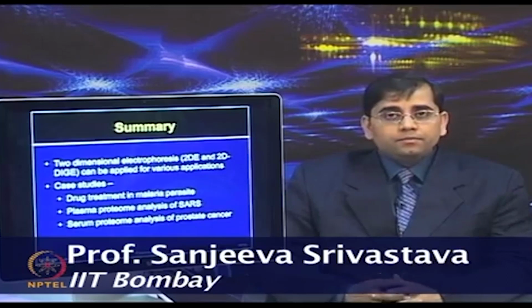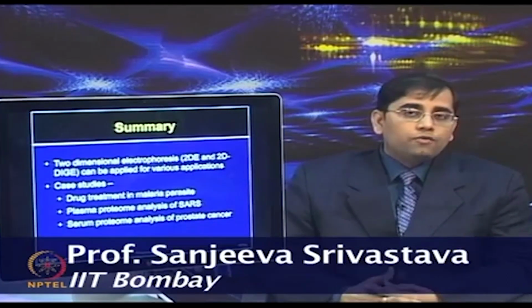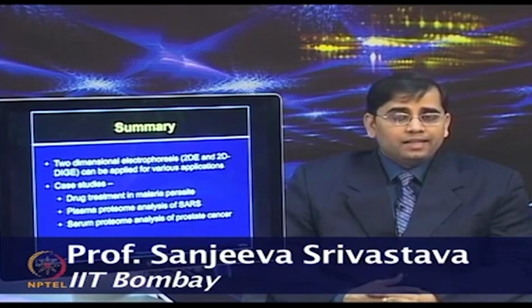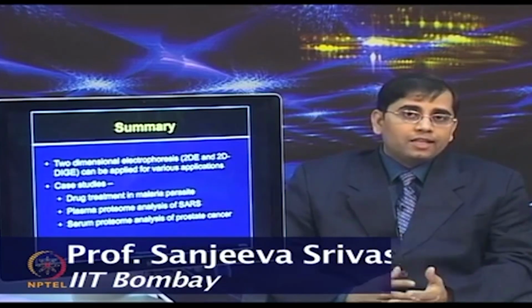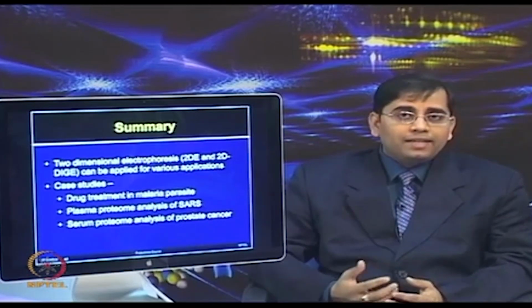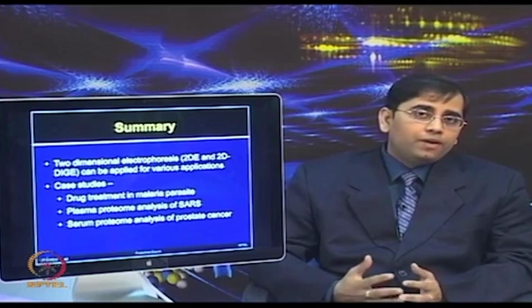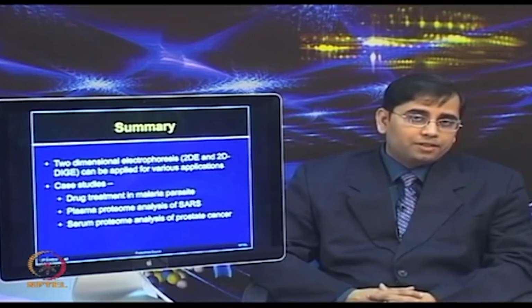One thing you will observe is that all the middle steps in the entire workflow of 2D and DIGE are very similar. It is the very first step, the sample preparation, which is quite distinct in each of these 2 techniques, and it is quite unique for various types of biological samples.